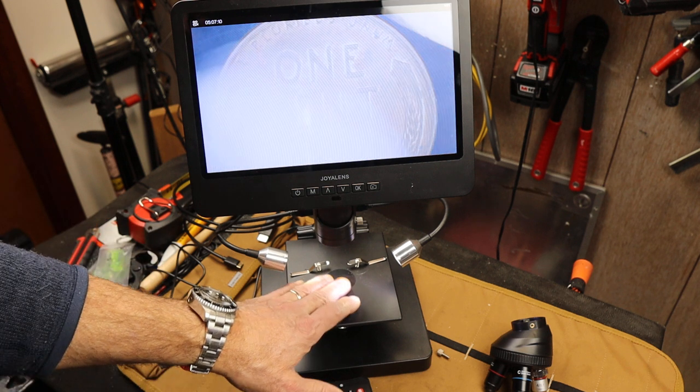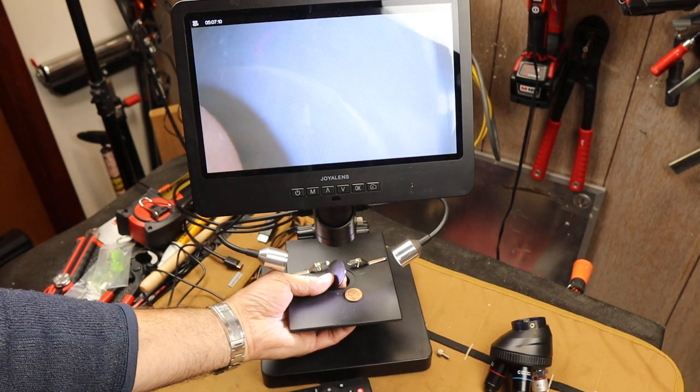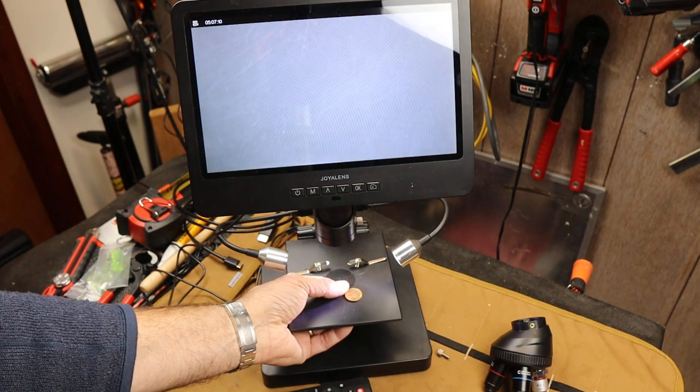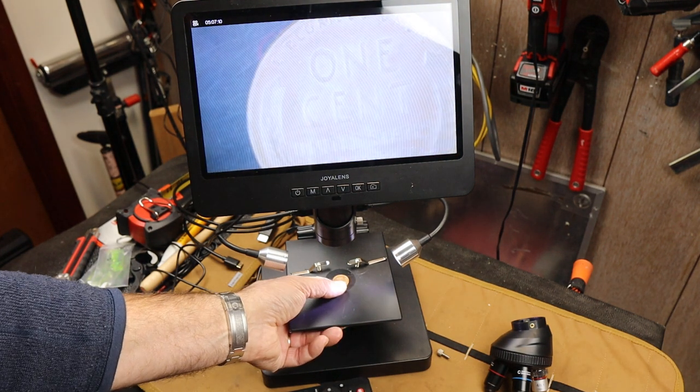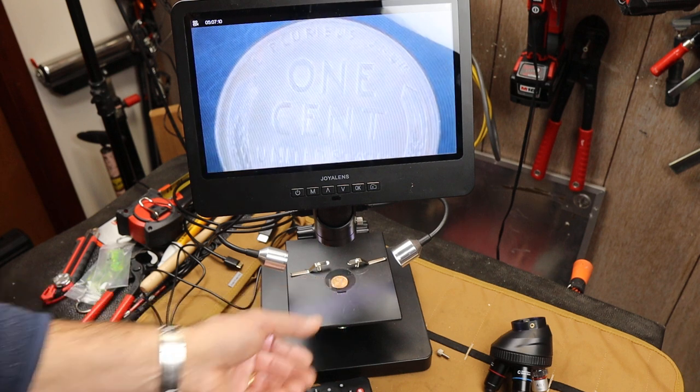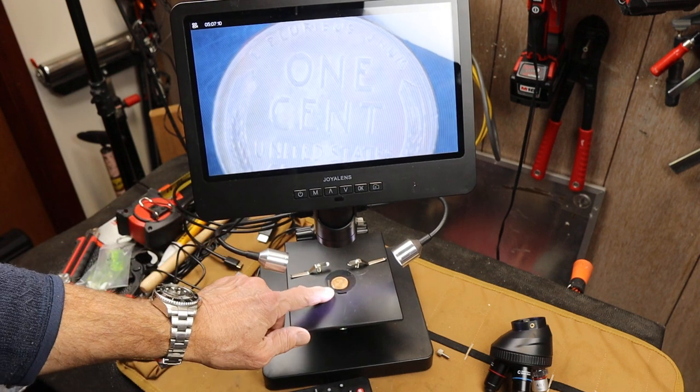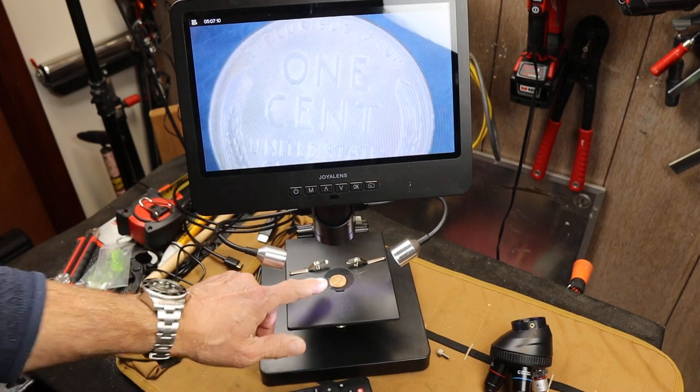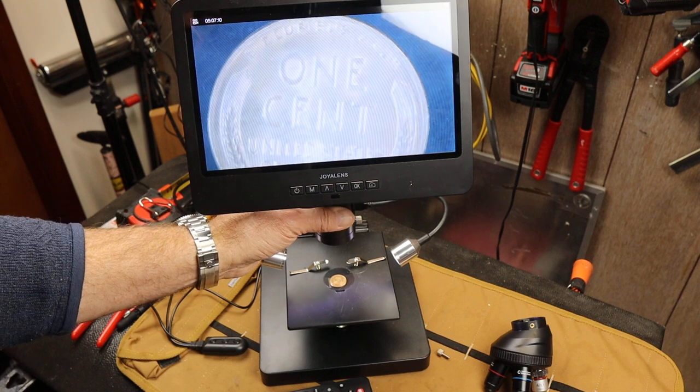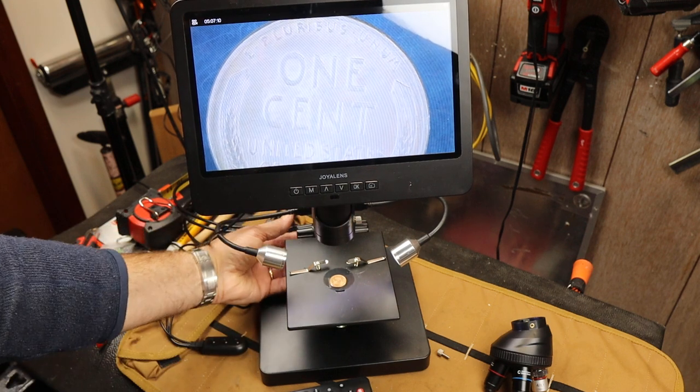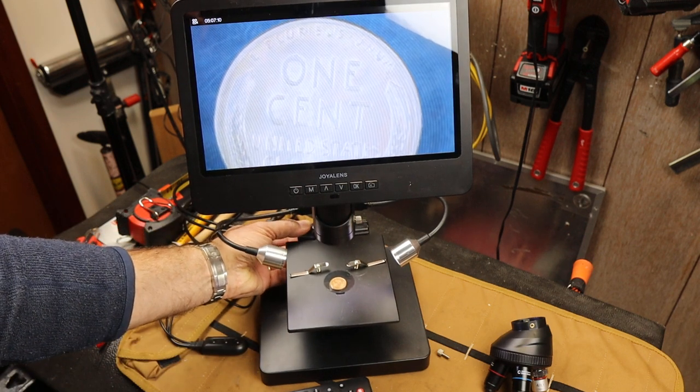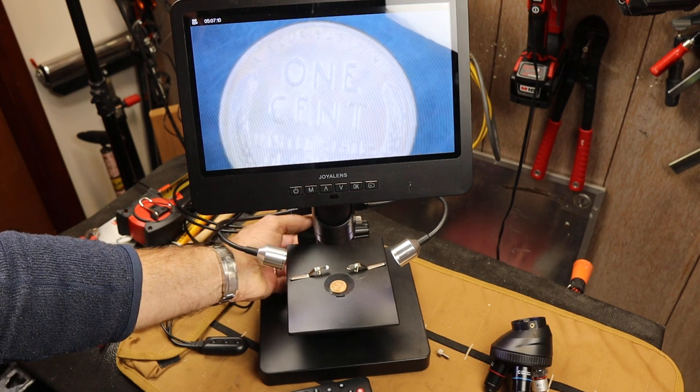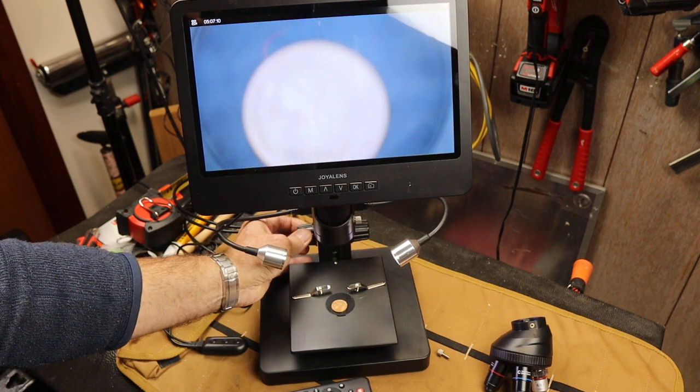So I'm using it now with an opaque base here. I can pop that out, and I'll show you a slide in a sec, but it does allow just crystal clear images right here. There's a focus barrel right here on the camera, and then of course, I've got the coarse focus on the stage.